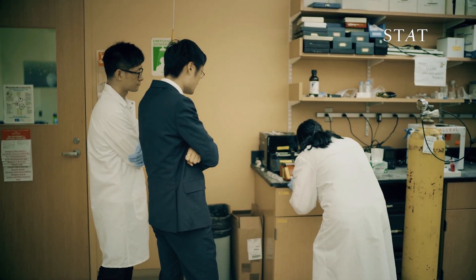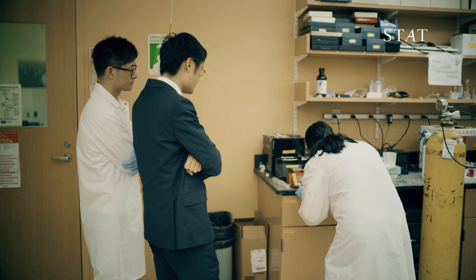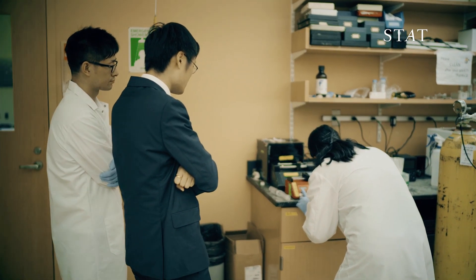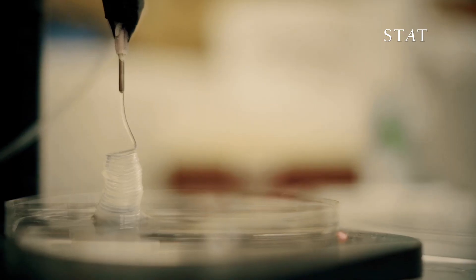I think bioprinting can really enable the generation of individual models at higher accuracy. And maybe with more time, we can start to also print functional tissues for regeneration purposes as well.